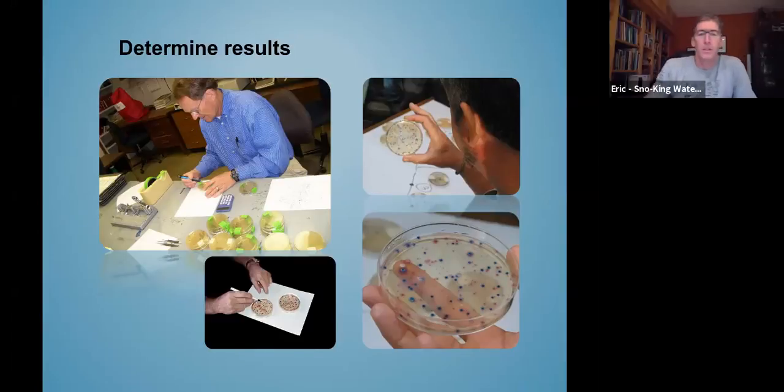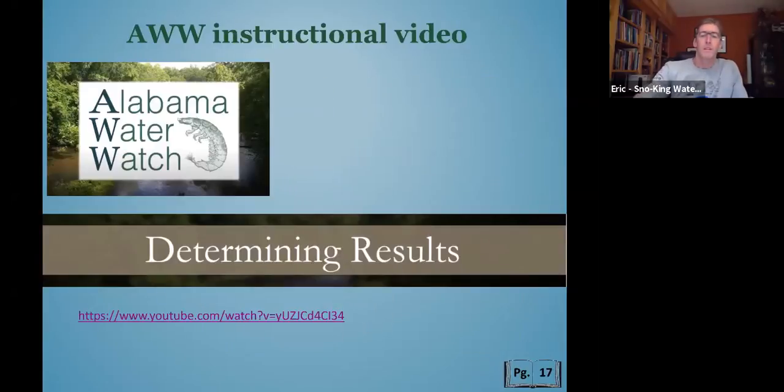Okay, so the next step. We collected our samples, we plated and incubated. Then our next step is going to be to determine the results. So I've got another little video to show you on how to do that.